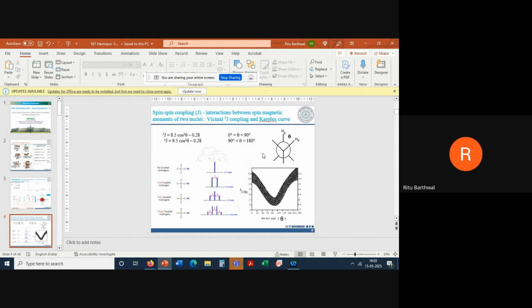So one thing in NMR is you get a line, so you characterize it. But the question you will ask is, such a sophisticated technique. I am dealing with methyl. I know there is a methyl present. There is an OH in my molecule. I am doing ethyl alcohol, let us say. So I have a methyl group. I have a CH2 group, methylene group. I have OH group. I will get 3 lines. And NMR will give me 3 lines.